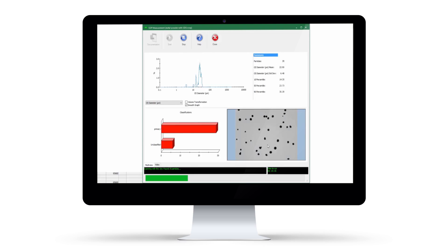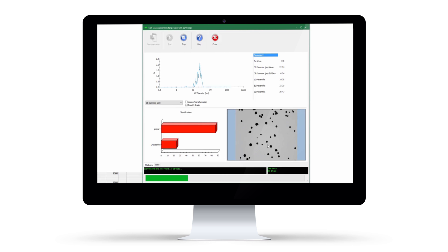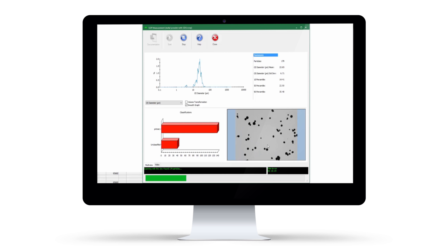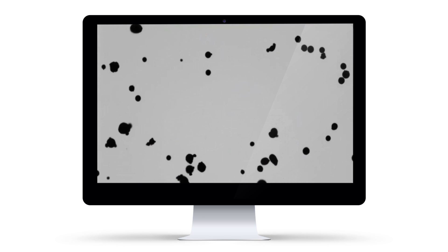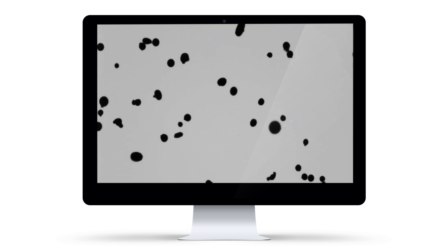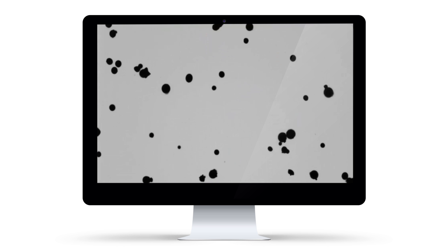Statistically representative distributions are automatically generated from the tens to hundreds of thousands of particles analyzed, providing valuable information on the whole sample.